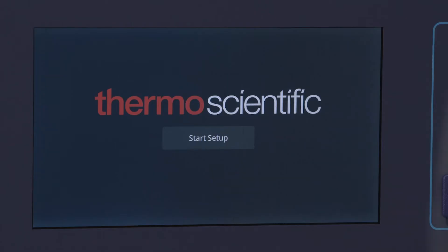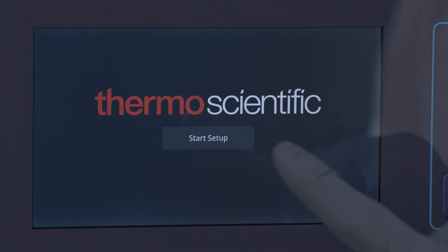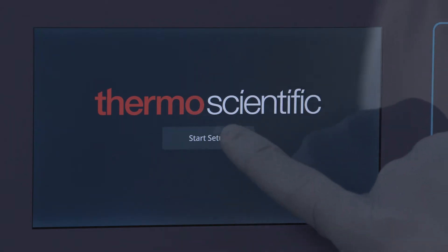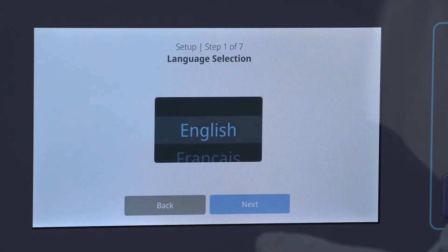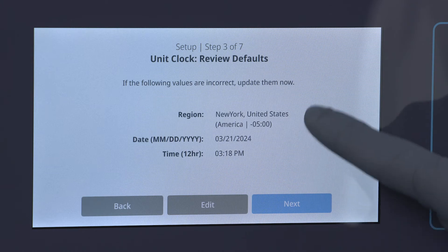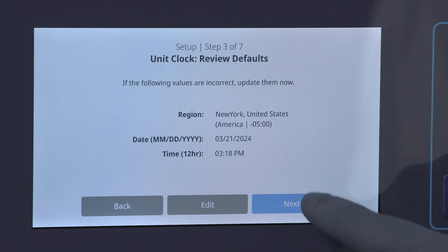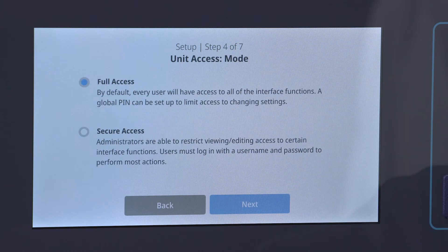When the TSX Universal ULT Freezer starts up, you'll walk through the startup wizard to apply basic settings like the unit name, location, time, and access mode settings.